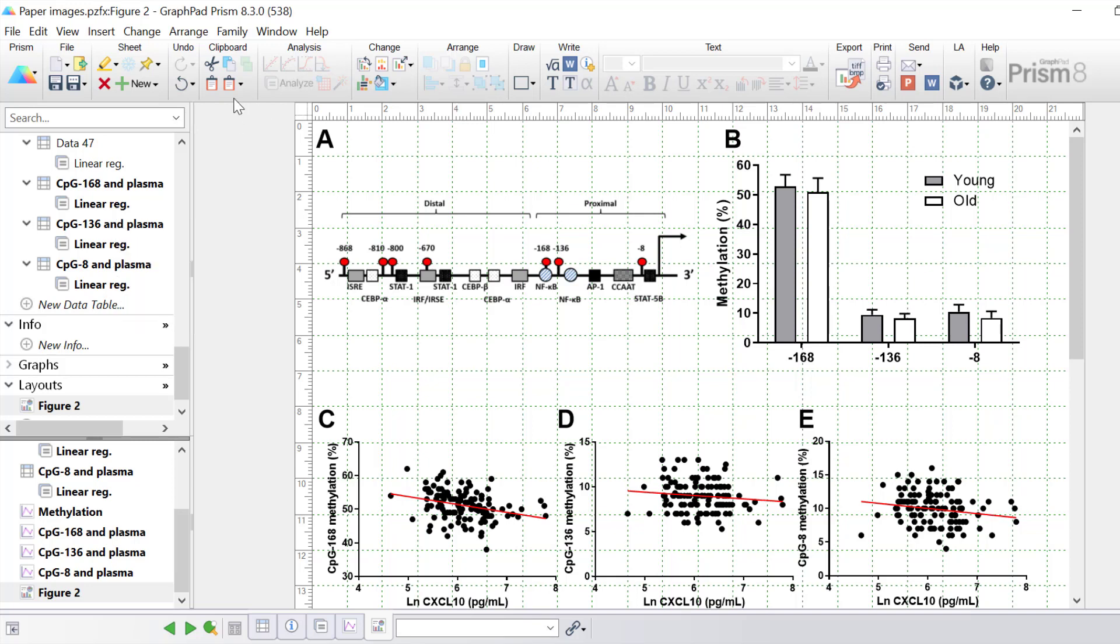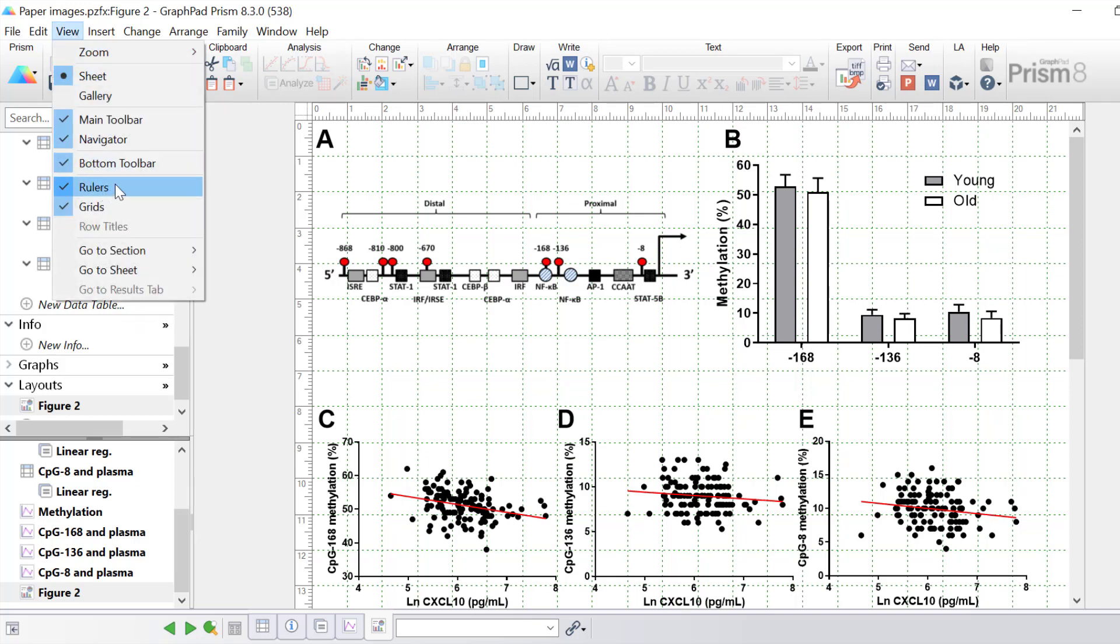If you don't want to view the rulers and the grids anymore you go back to view and untick rulers and grids.